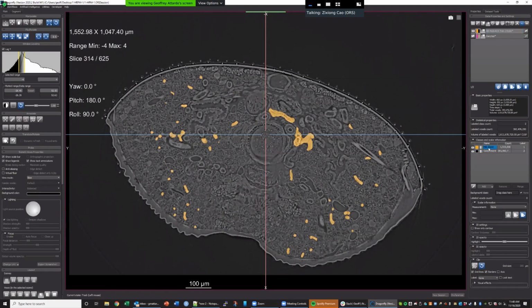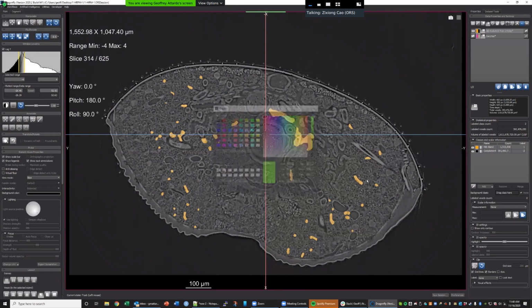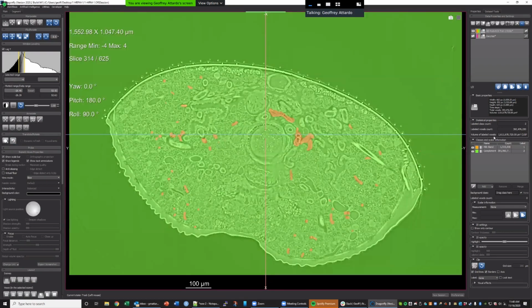It has the milk gland taken from your ROI, and it filled everything as background, but the background is black, so you don't see it. If you want to see it, you can check the color. This one could be loaded in the wizard to fill the frames.